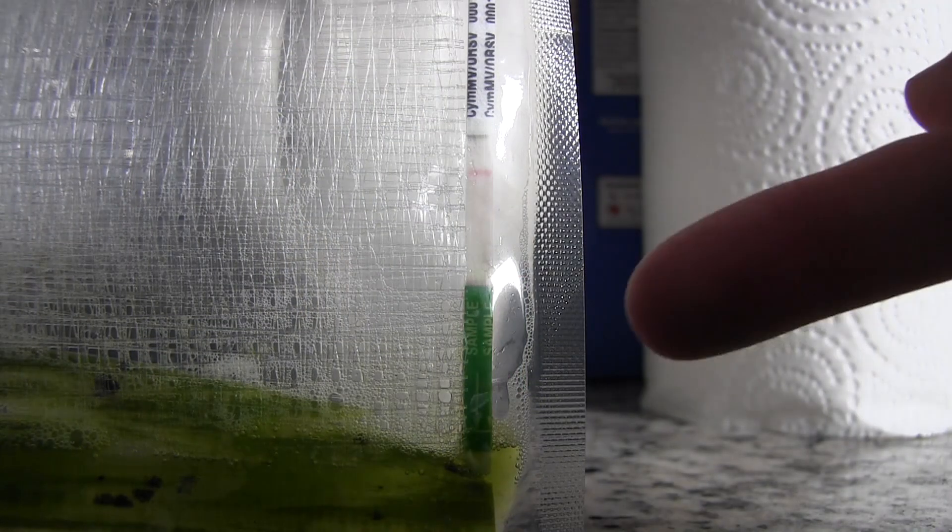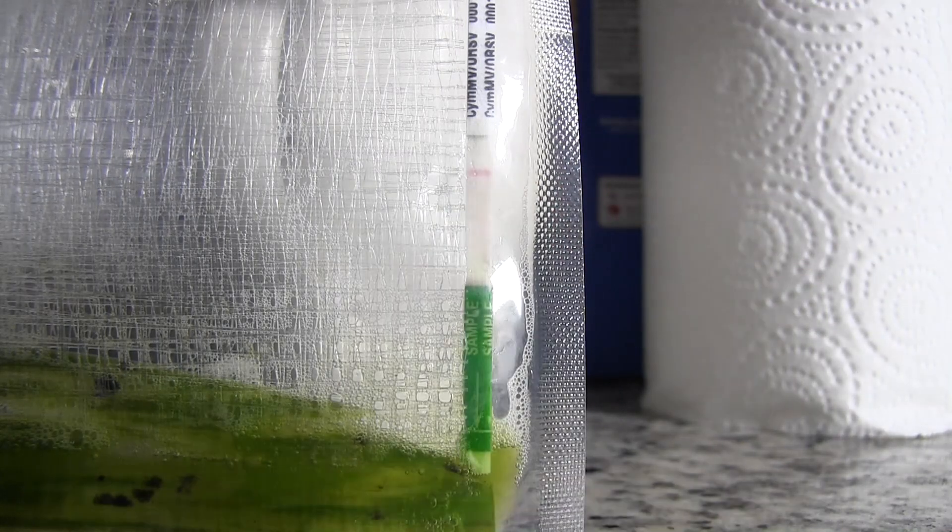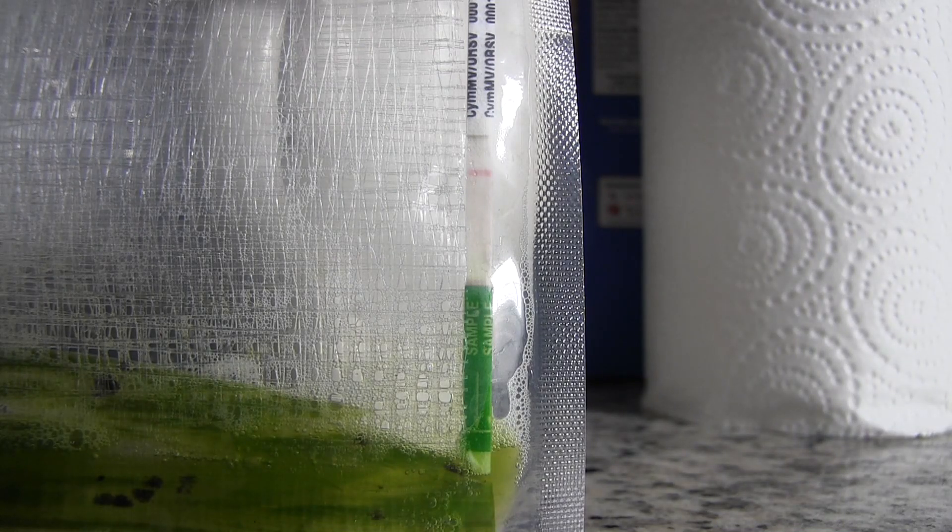The solution has gone all the way up the side and soaked into the test strip, and only one line is showing — and that means that this plant is virus free. I am thrilled to be given a beautiful orchid that is virus free.